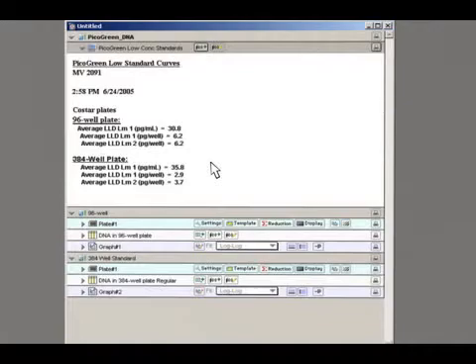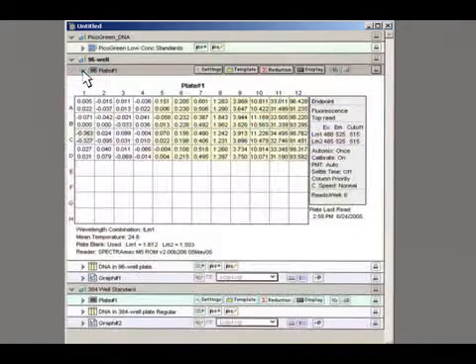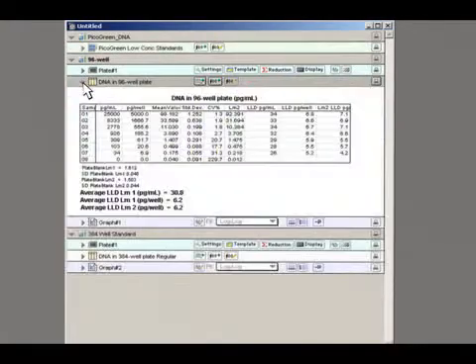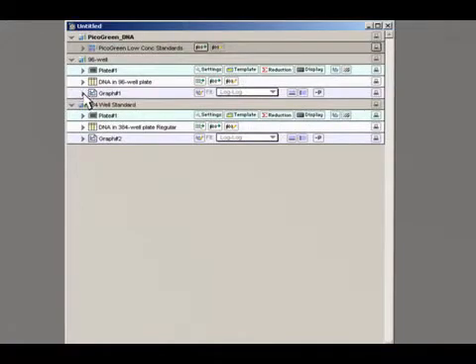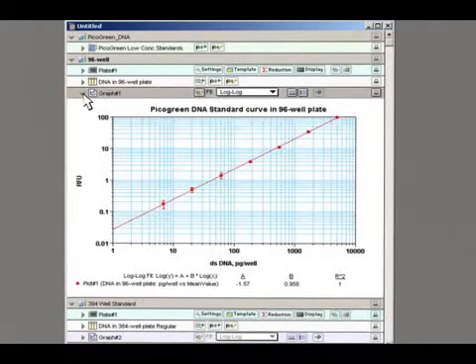Here, you see some data summaries. In the plate section window of SoftMax Pro, you can organize the data in the plates into different group types and display the instrument settings. All of your data analysis settings are presented in one easy-to-navigate environment. The different groups can be organized with various calculations. Statistical calculations and graphs can be set up depending on your needs.